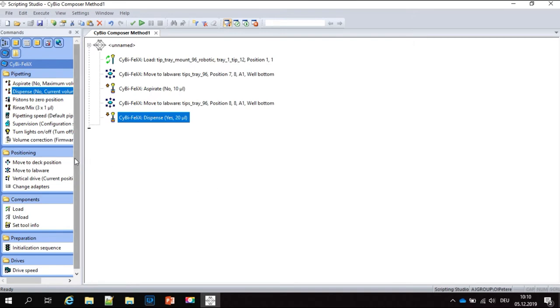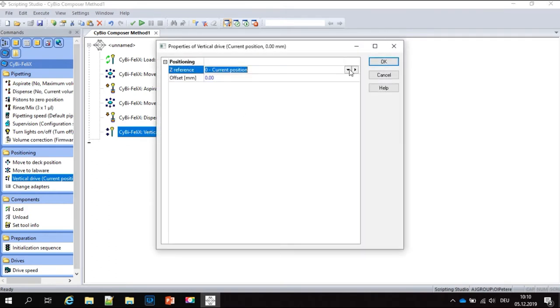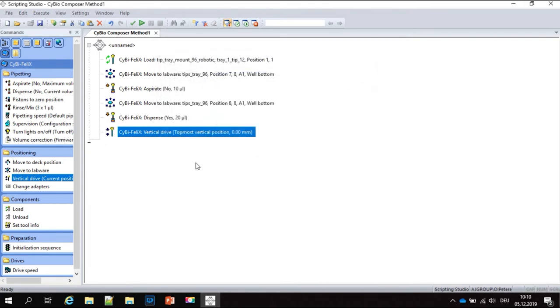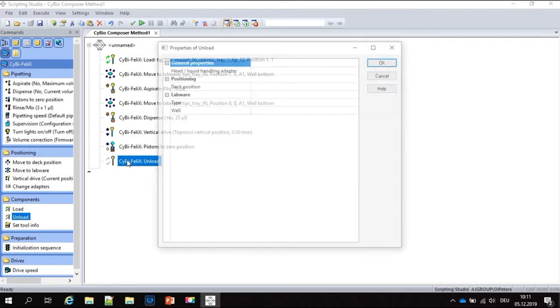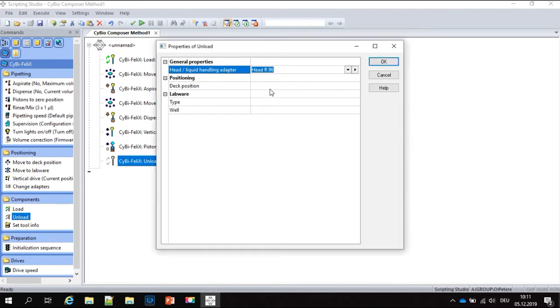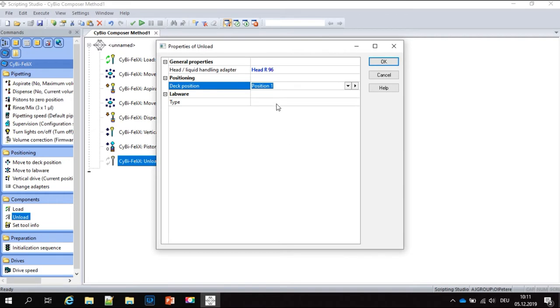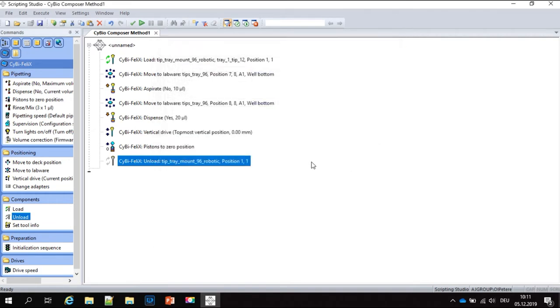After the blowout, we move the tips out of the target plate using a vertical drive command to the topmost vertical position. Then a pistons-to-zero command resets the piston system and prepares the head for the next pipetting operation. Finally, an unload command releases the tips back to their original position on position one with the 70 millimeter adapter. That's the complete simple transfer program — simple, isn't it?